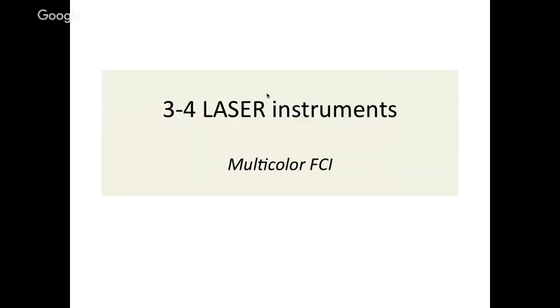More lasers, more colors, more complications, more troubleshooting. So multicolor flow is the fashion. You have more lasers, you have more colors. But one has to be careful about the troubleshooting and the issues related to highly sensitive instruments.